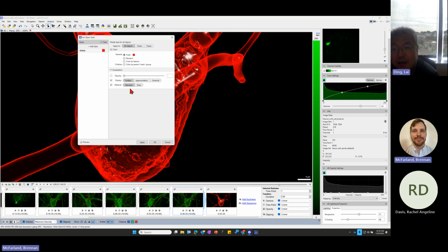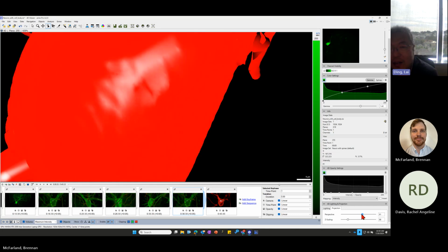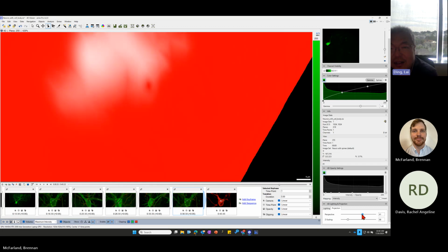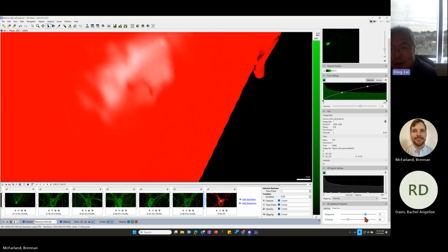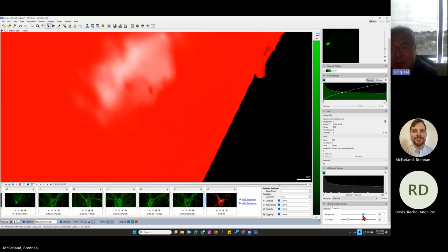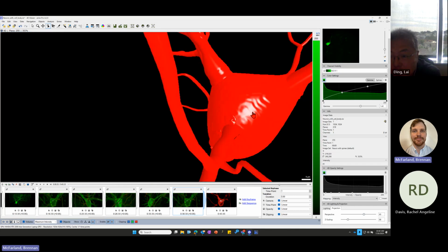Yeah, I haven't tried it. Just in the case if the red object is a cell and we have some other object inside it, we can kind of have a movie go inside it. Then we can see the other object, but we can also see the background as the cell, like a membrane wall. Yeah, it looks like you can. It's hard to make it out, but you can make out kind of these ridges right in here.